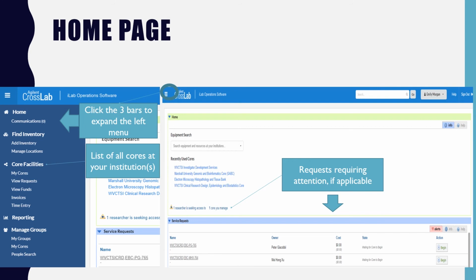The first thing you see when you sign in will be any requests to cores requiring your attention, if that's applicable. You'll also see an equipment search or any recently used cores. Up in the top left, you'll see 3 bars or the hamburger. That will expand the left menu, the center of iLab navigation.